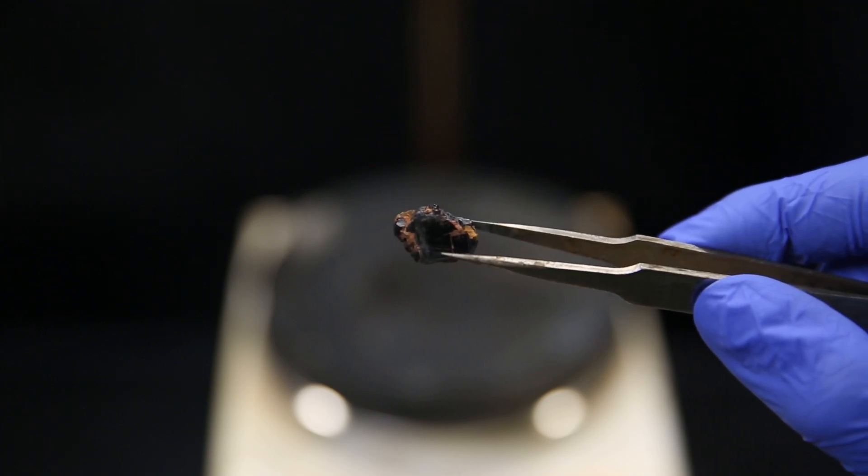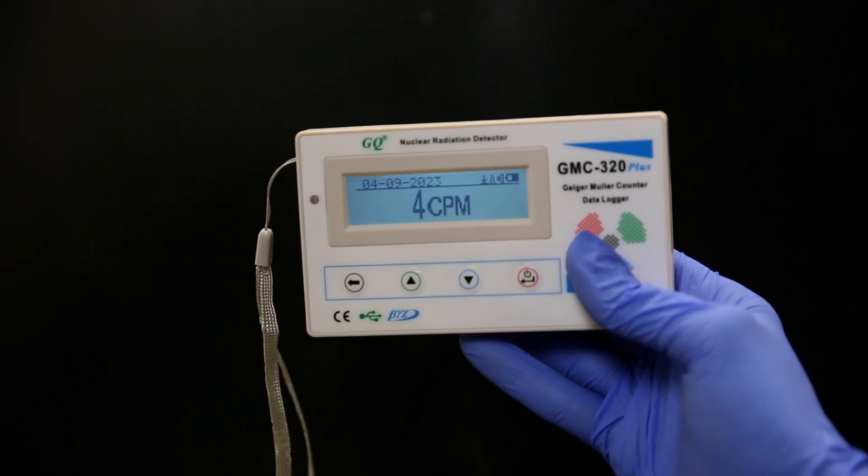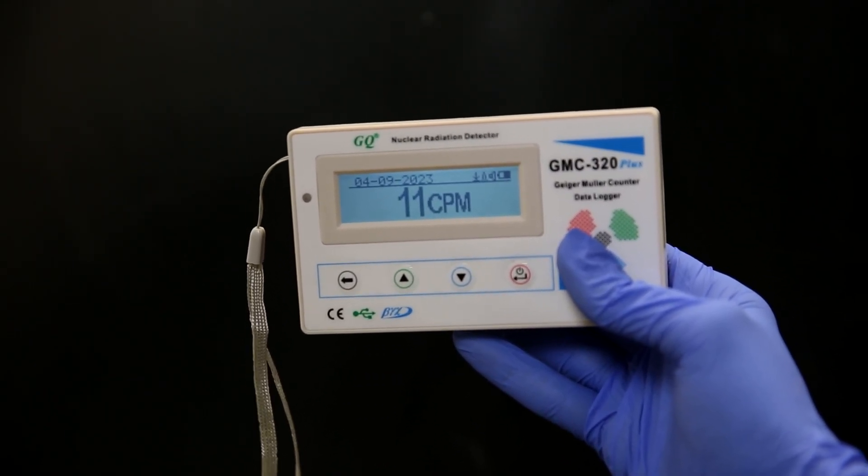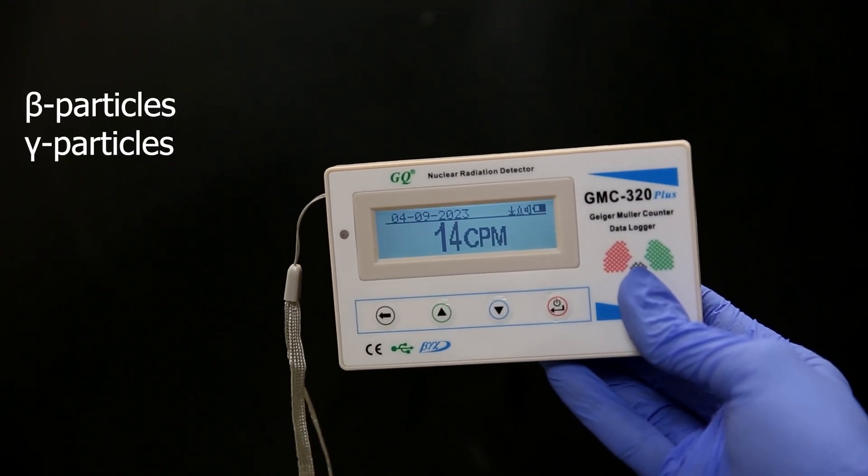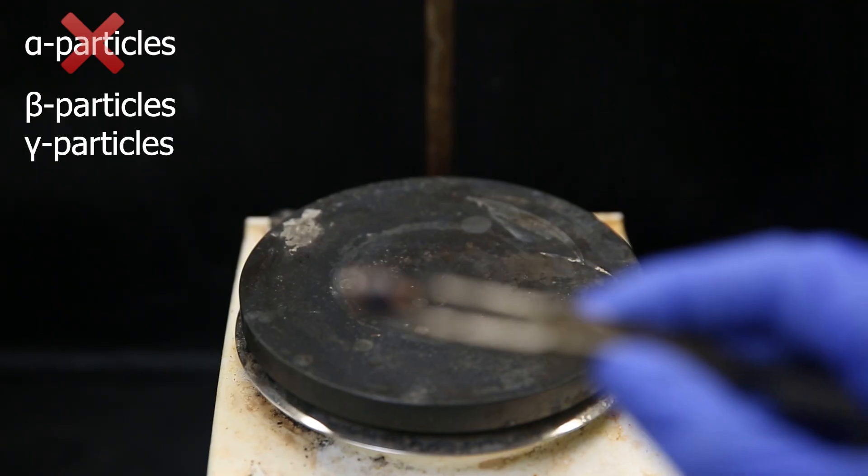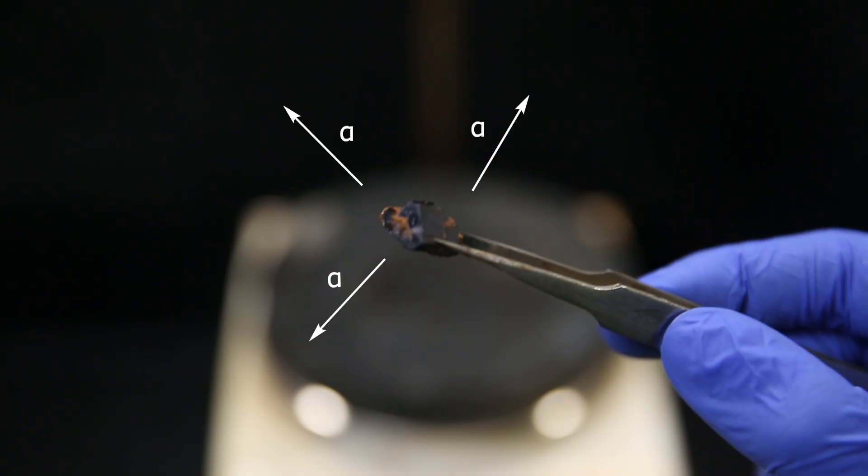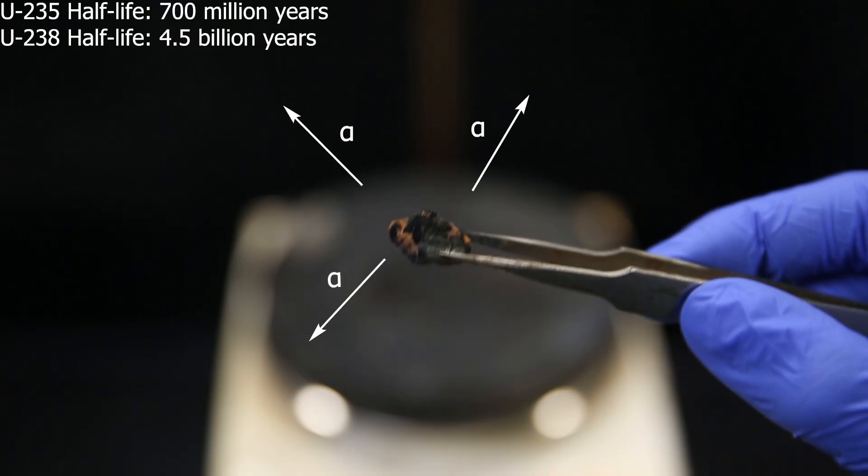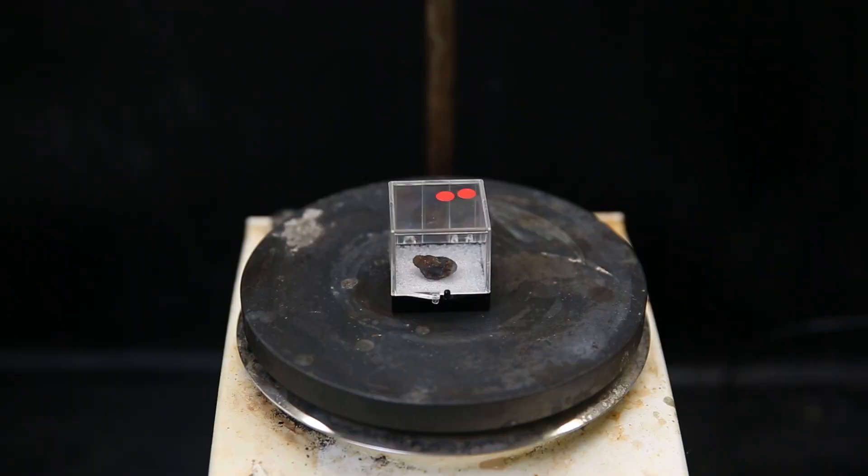Before I measure the radiation from the rock I will do a background check to measure the normal radiation levels at this location. So the background radiation is between 10 and 20 cpm here, which is only from beta and gamma particles, since this device cannot measure alpha particles. Now uranium only decays by emitting alpha particles, and uranium is also pretty stable, so it doesn't give off that much radiation when pure, especially if it has been depleted. But this is natural uranium and thus is a little more radioactive.